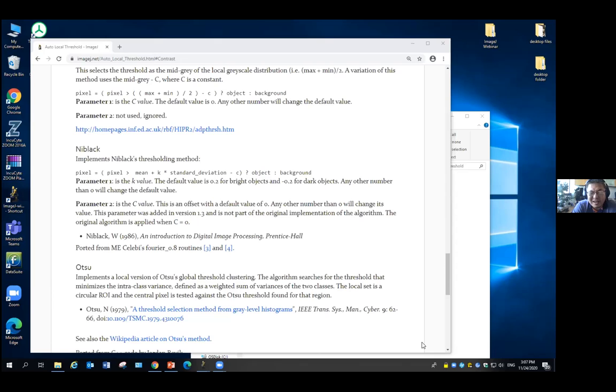No matter what kind of thresholding method, the Gaussian blur or any kind of smoothing method, or subtract background, you can do whatever you think is best to help you create a mask image. But you have to remember, once you decide all the steps, you have to apply the same steps to all the images.